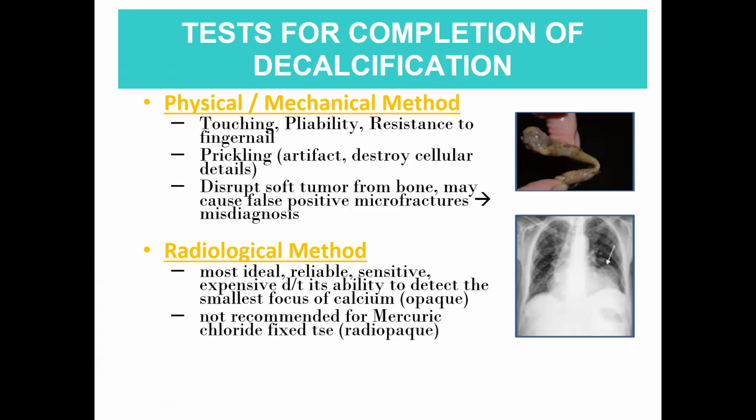Excessive use of the physical or mechanical method may also result in disruption of the soft tumor from the bone, which would lead to false positive microfractures and may lead to misdiagnosis.